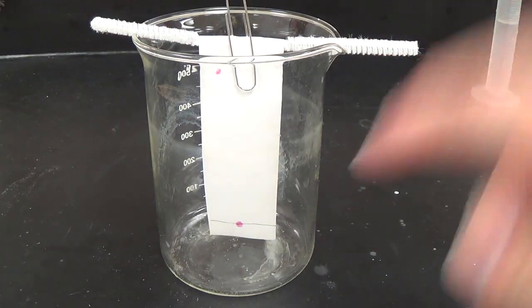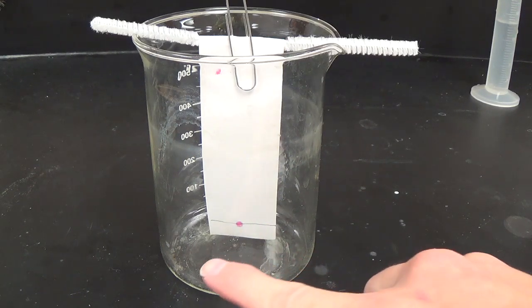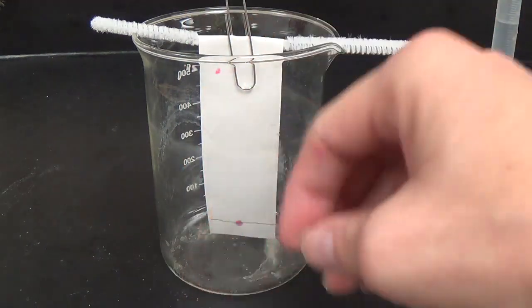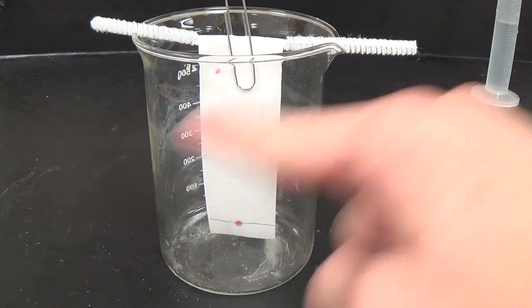So your setup should look like this. And see how it is barely resting above the bottom of the beaker. So either barely touching or resting above. What you don't want to do is just ram the whole thing down into the bottom, because crumpled up at the bottom is going to do you no good at all. Notice the beaker's been dry so far.